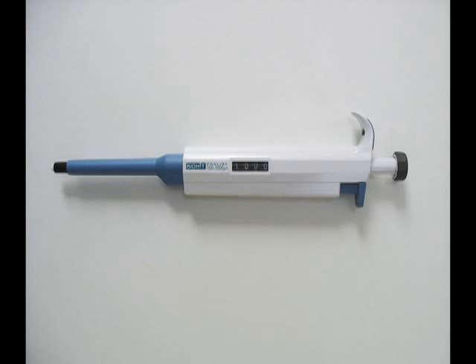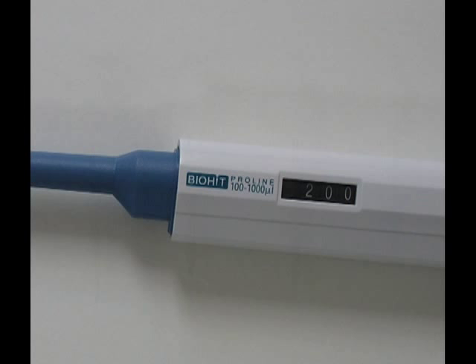Every pipette has a set range, meaning that it will only dispense between the volumes stated on the pipette.